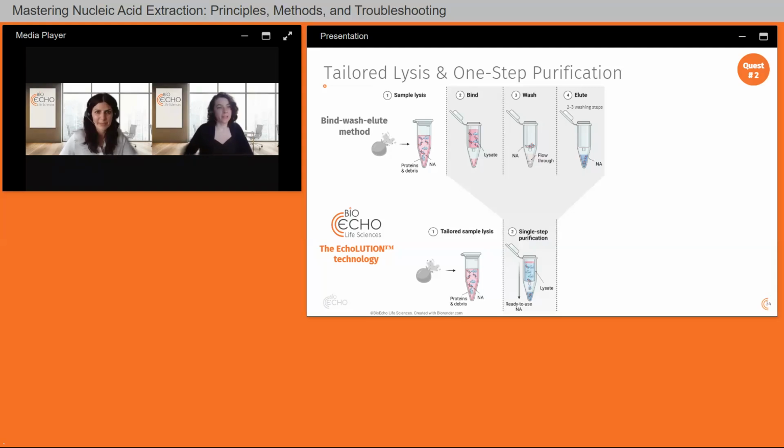Mm-hmm. And I think here it's also important to think what you need for your downstream application, if you need more concentration or yield, because that's different, right? And maybe to the person who was asking the question, I'm very interested: do you have a liquid sample or a tissue? Because what we definitely can do, if you have, for instance, a little piece of tissue, we already had this little tiny one, we adapted the lysis volume and then it worked for us. So don't give up here. Reach out to me if I can help you.